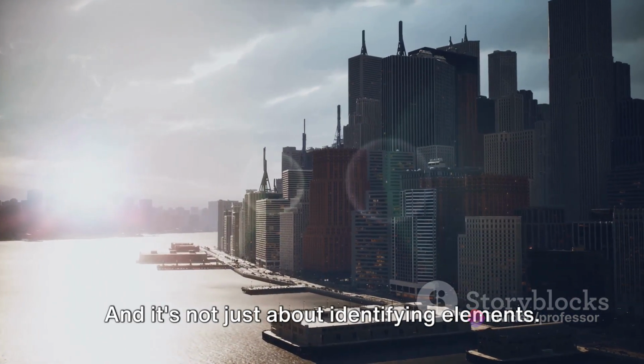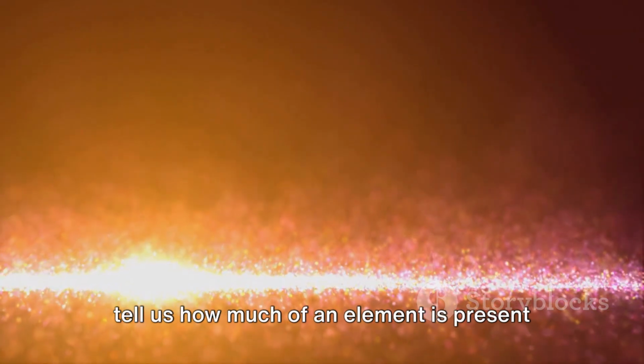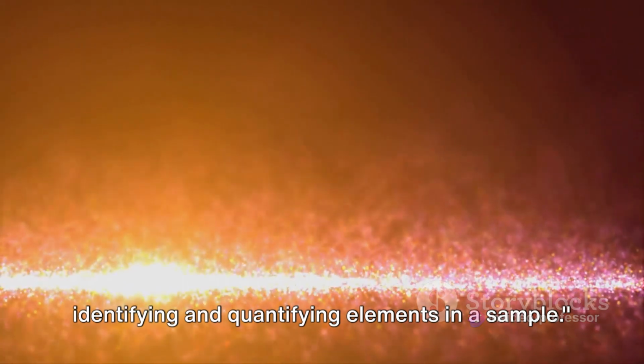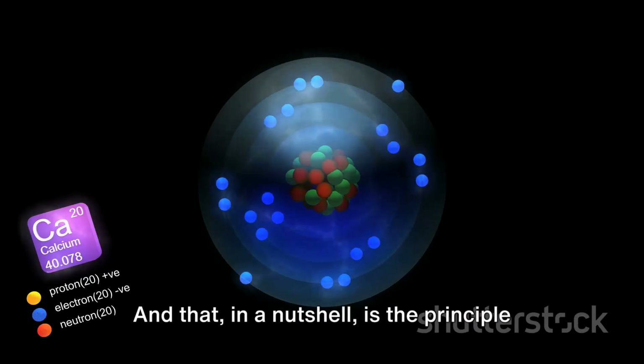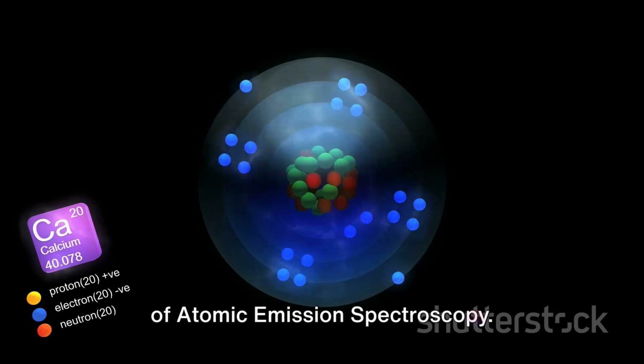And it's not just about identifying elements. The intensity of the emitted light can tell us how much of an element is present in a sample. So, in a way, we can also quantify elements. This uniqueness forms the basis of identifying and quantifying elements in a sample. And that, in a nutshell, is the principle of atomic emission spectroscopy.